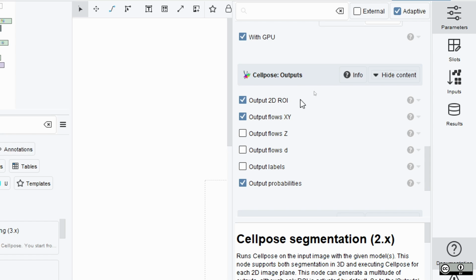If you want to learn more about how Cellpose works, how well does it recognize the cells, for example, then you can turn other outputs on, which, for example, will show you a probability map where the bright pixels will belong to the cells that it identifies, and the dark ones will say these are not neutrophils. This we will not use. I leave it on to show you later, but to test and fine-tune Cellpose, these are important, but for now we're not going to go into that.